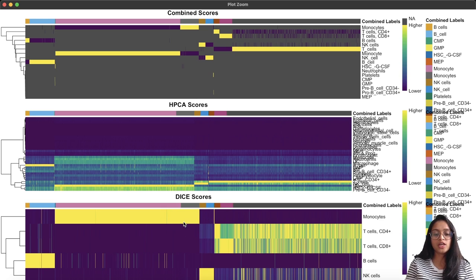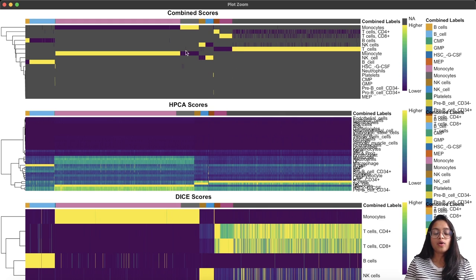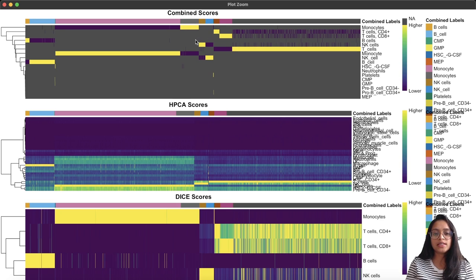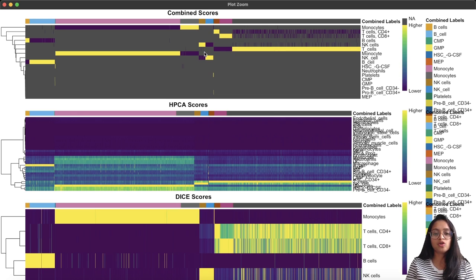In the combined scores heatmap, only the labels predicted in the individual references have their scores recomputed; the rest are set to NA, which is why we see a high proportion of gray in this heatmap compared to the individual reference heatmaps. The individual heatmaps visualize the initial assignment scores or pre-tuned scores stored in the matrix, serving as a useful diagnostic tool for identifying high-scoring labels associated with cell types or clusters of cells. The combined score heatmap shows that cells with their final assignment have high scores for those labels, giving further confidence in the assignment.